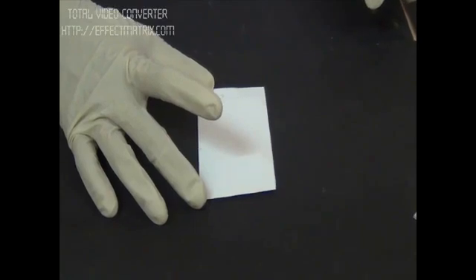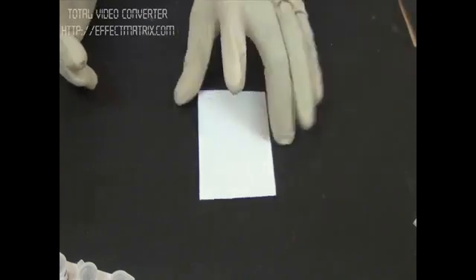a pre-coated TLC plate, and today we'll be separating amino acids which are present in a mixture. And we have three standard amino acids. One is threonine, another is methionine, and the third one is lysine. On the plate, we have prepared the line of origin and we have labeled 1, 2, 3 and mixture. We'll start with 1 and subsequently all the 4 samples.